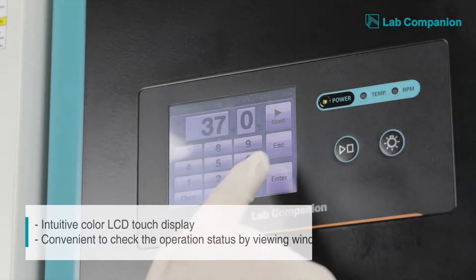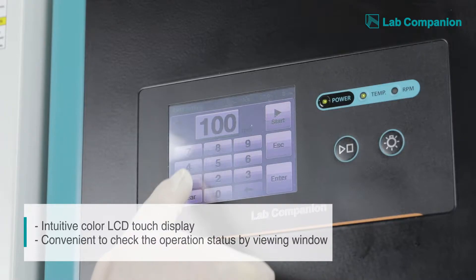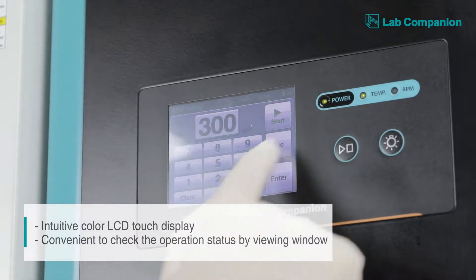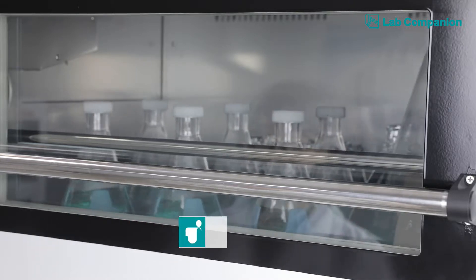Once all samples are loaded, the user can conveniently enter the device configuration using the touchscreen color LCD control panel and easily monitor the ongoing operation status through a large inspection window.